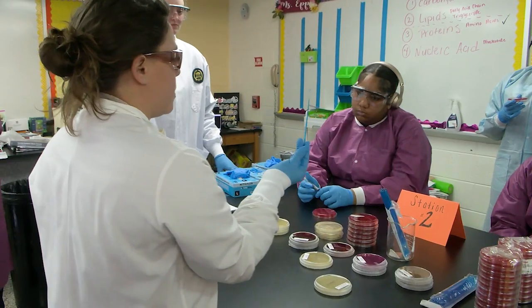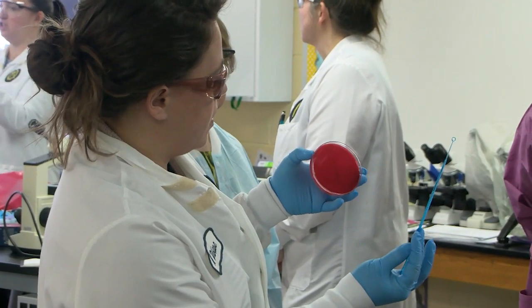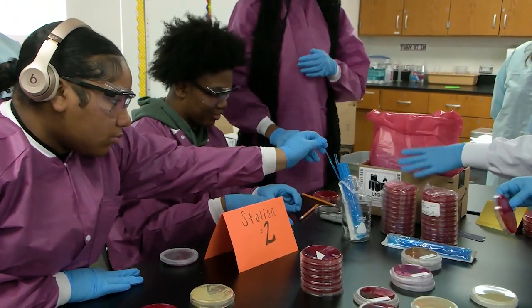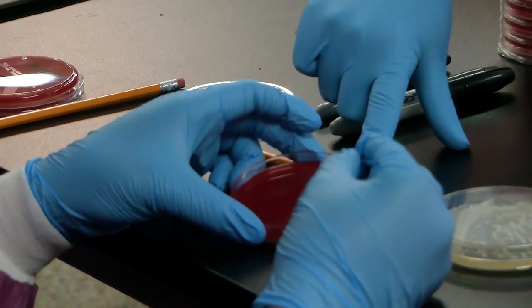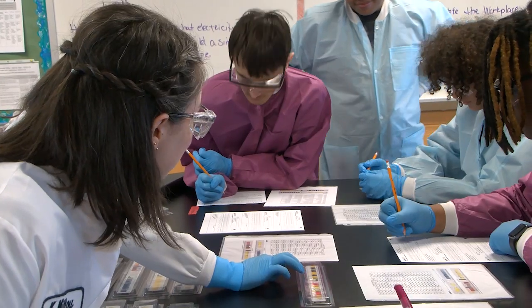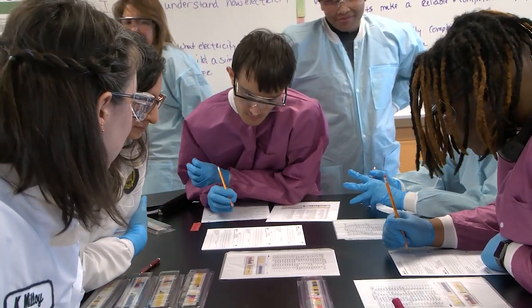Like they really in that moment felt like scientists, whereas I can't necessarily with high confidence say that they felt that way before. I usually hold it flat. My goal and my aim is to expose students to as much as possible and for them to really gravitate towards whatever their passion is and whatever they want to pursue further interest in. If it's kind of greenish, we'd say you probably start with negative.